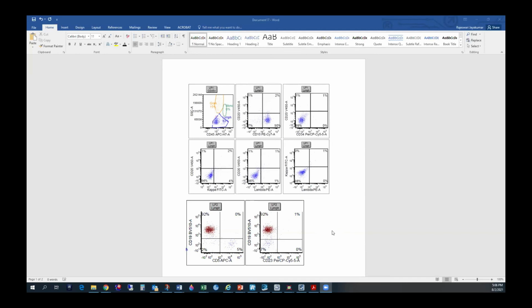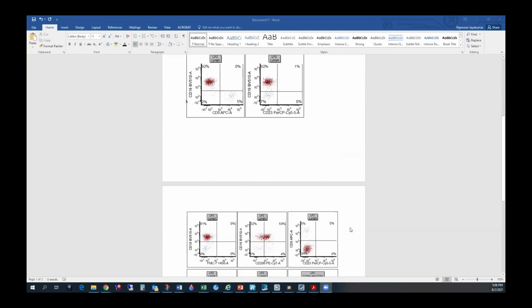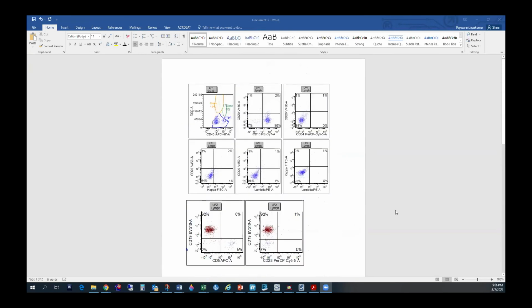I have seen such a local involvement of B-ALL. Like one of the B-ALLs that I have seen, there was a small, tiny population of blasts in the bone marrow, and everything else was very good. Like it was so focal. I was like, is this just a focal population of hematogones or what? I was so confused in that one. If it is hematogones, you will also see an accompanying population of mature lymphocytes.